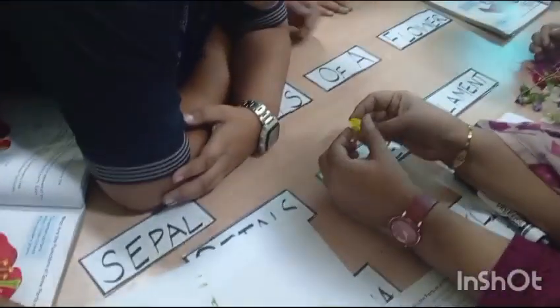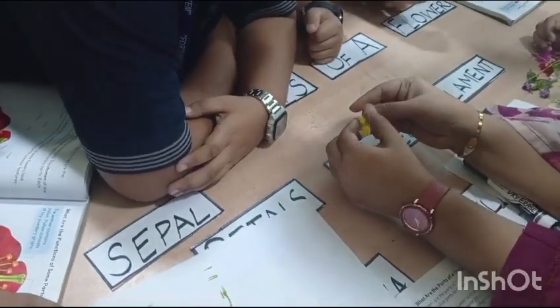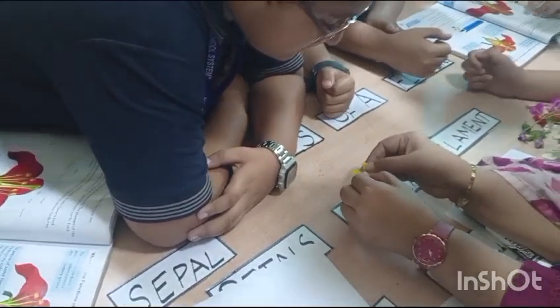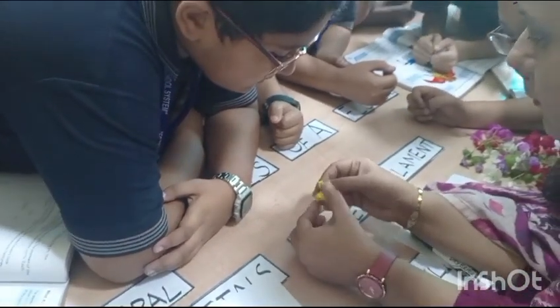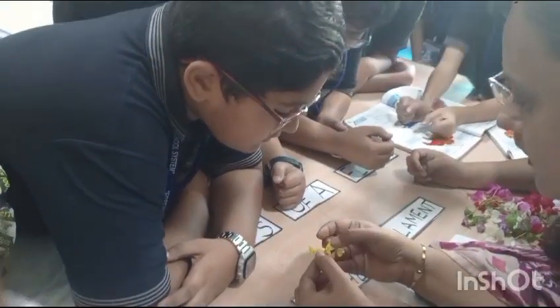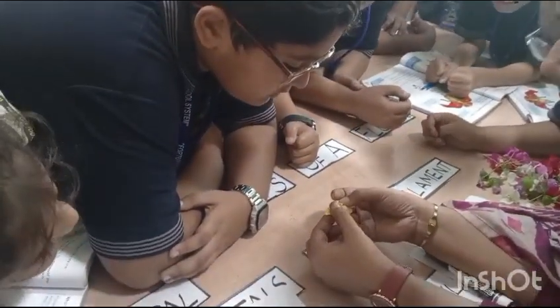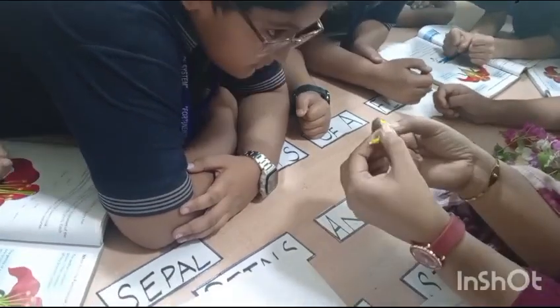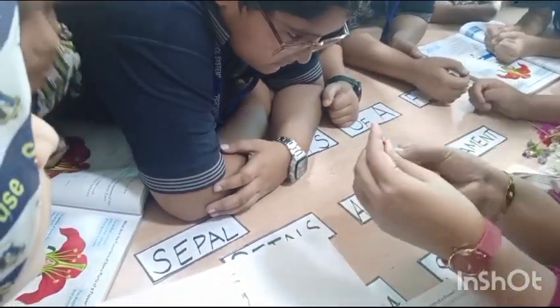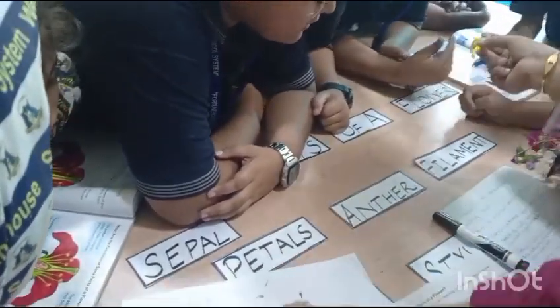If we look inside the flower, I separate the flower with the help of a needle to further explore the different parts of the flower. Okay, let's see what is inside. You can see this part at the top, the stigma. Where is the stigma? At the top.